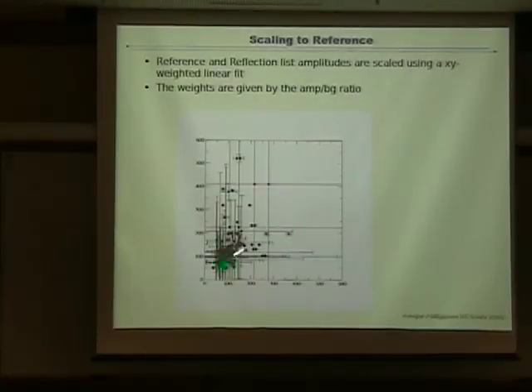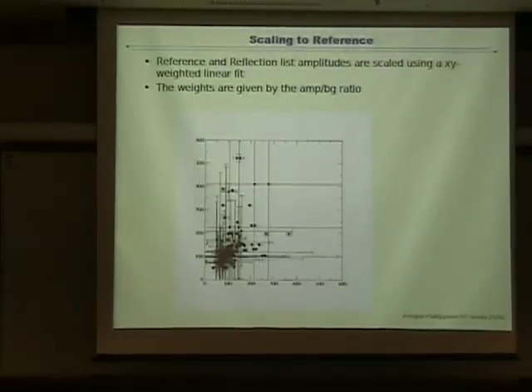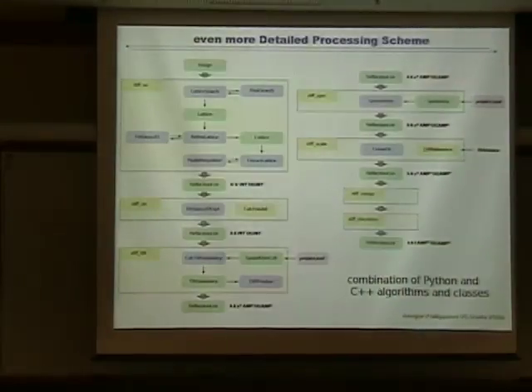So then you multiply the amplitudes and the sigmas by the scaling factor, and then you have the merge and the discretization. Now the discretization we don't have. So let me go back here. Up to here, everything works routinely.